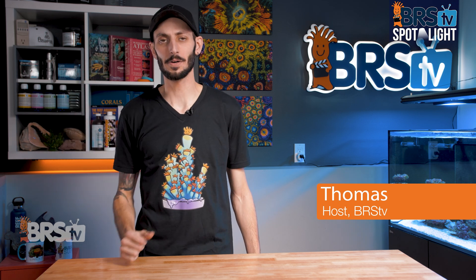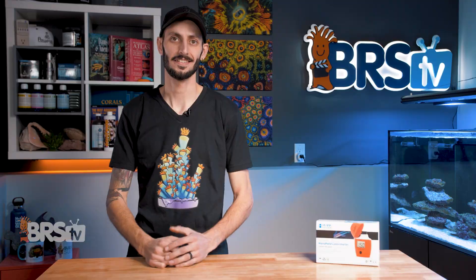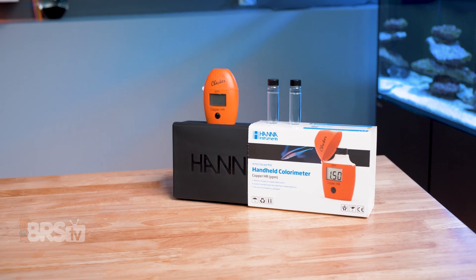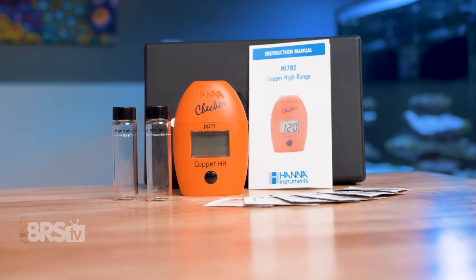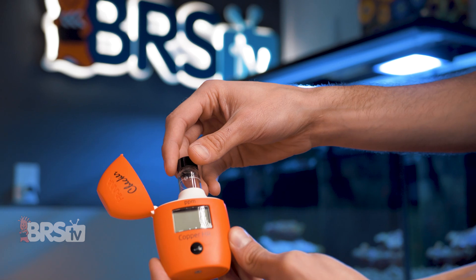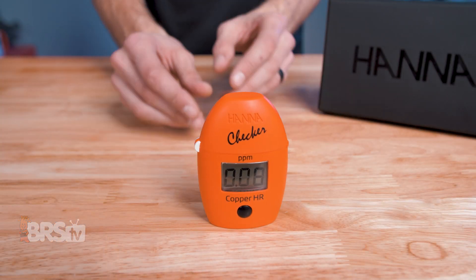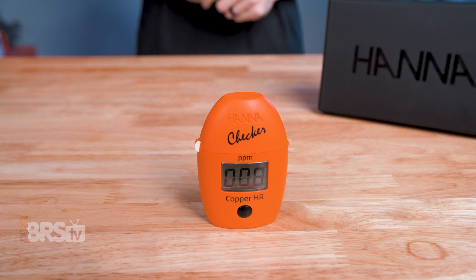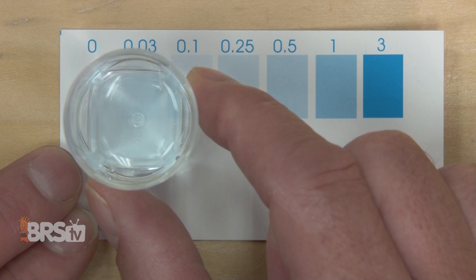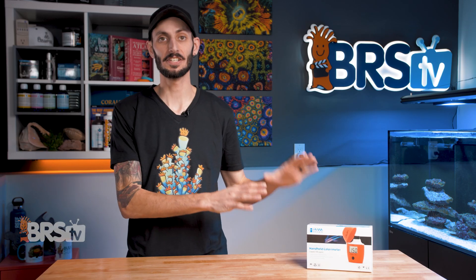Hey, it's Thomas here, and today we're going to be taking a look at Hanna's High Range Copper Checker. If you're going to medicate your fish using copper and need an accurate and easy way to measure the copper concentration in the aquarium, regardless of what form of copper is being used, that takes under two minutes to perform and provides a digital reading between zero and 5.00 ppm, so you don't have to squint at the minute shades on a color chart trying to figure out which one it is, then check out Hanna's High Range Copper Checker.